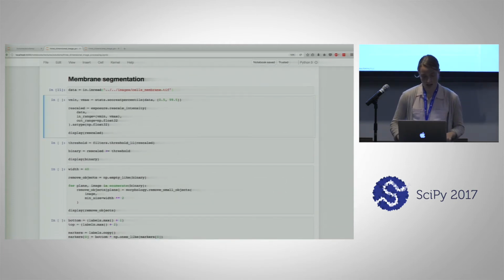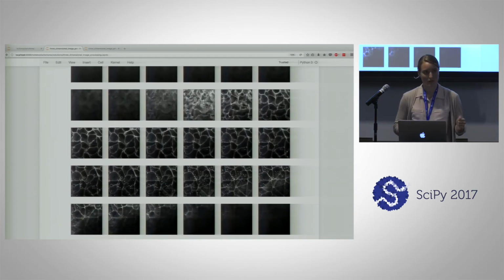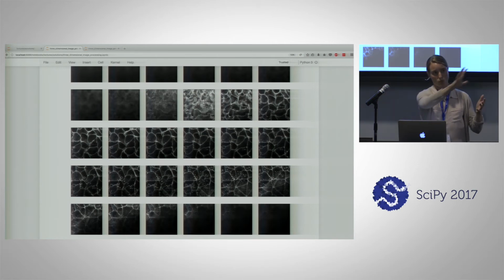So let's take a look at that membrane image. I'm going to apply that same rescaling. Ooh, that's gross. It's pretty murky as we transition into the top of the membrane, and then we see nice membrane walls, and then there's a lot of speckly noise, which is either debris or some other part of the cell that adhered to the stain when it was imaged. And then the membrane wall does not uniformly disappear. We see this sweeping from the bottom corner up to the right as it disappears.